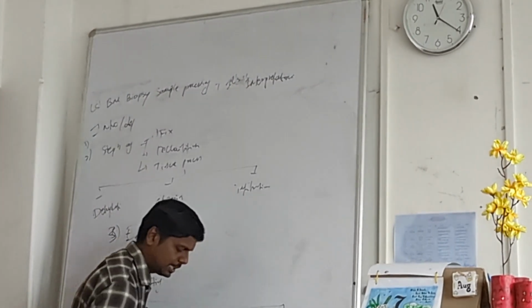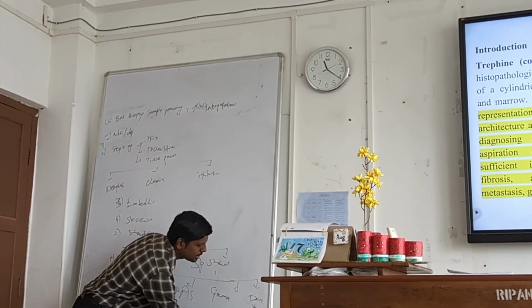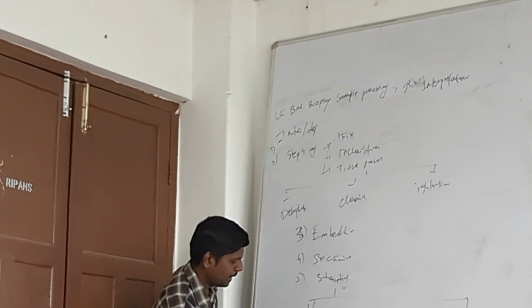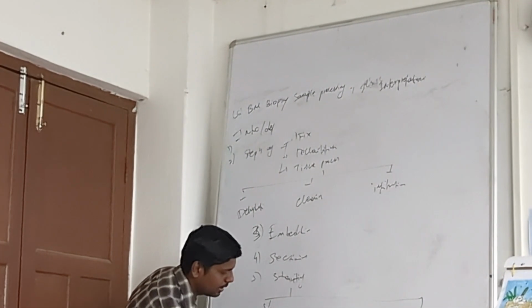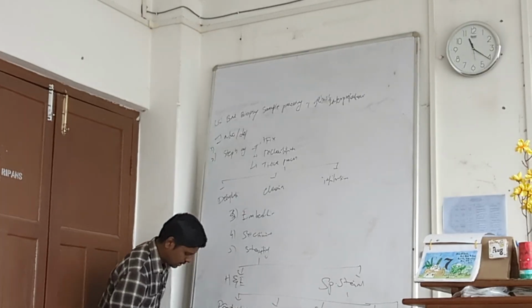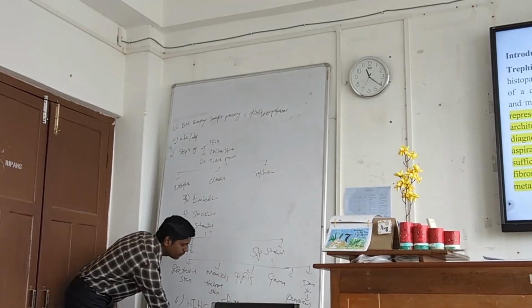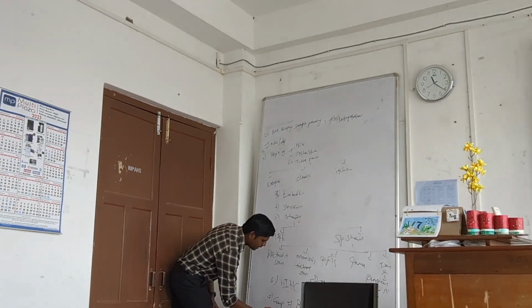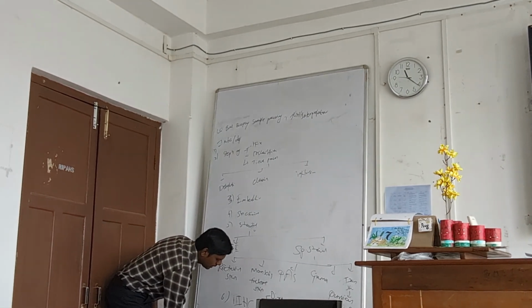Iron stain is also called Perls' Prussian blue stain. Then I will go further with the 6th one, IHC, immunohistochemistry, where we will cover direct and indirect. Then I will focus on the comparison of bone marrow aspirate versus bone marrow biopsy. And last and final, results interpretation and troubleshooting.